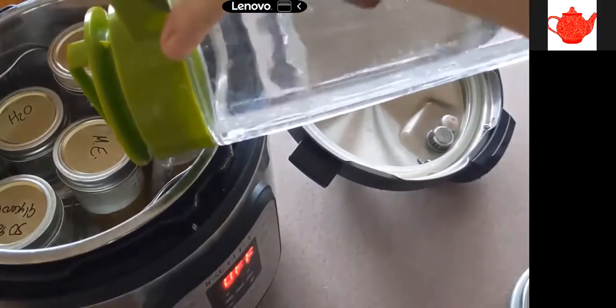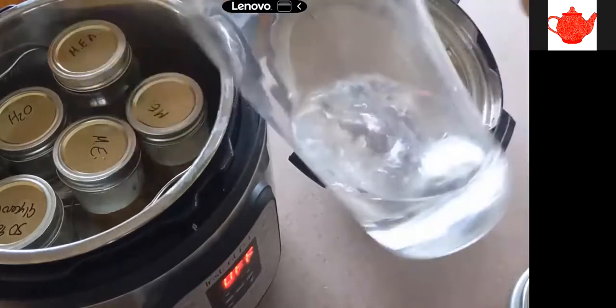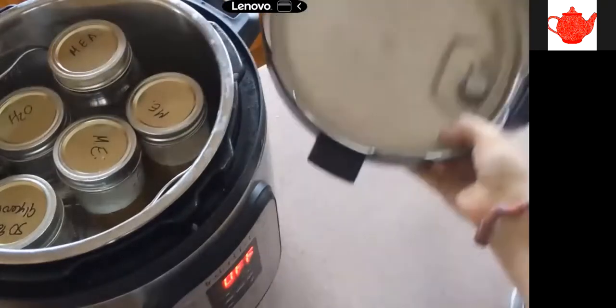So someone asks in the chat, the water that you're sterilizing, is it distilled water or tap water? It was actually filtered water. I mean, you could use distilled water, but admittedly, I have an RO system on the sink at home. So I'm generally using reverse osmosis water because that's what I have available. If you just have tap water that's run through a filter, that's fine too.